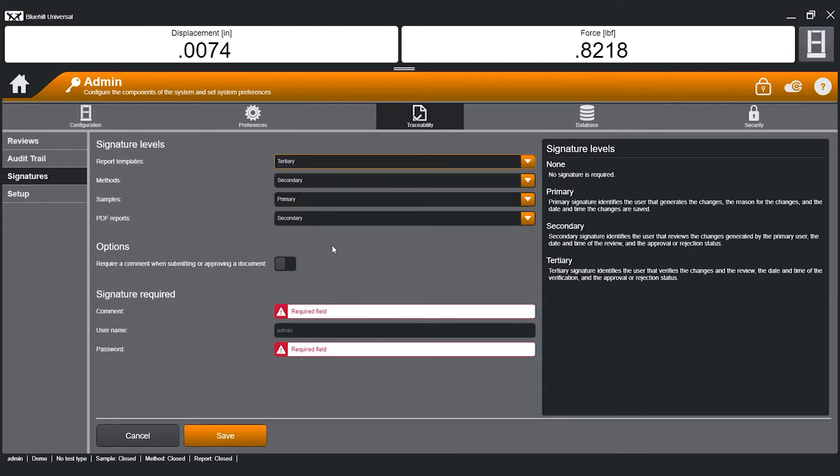Each Blue Hill file type can be set to require a different signature level to meet the requirements of your lab. If signatures are not required, this selection can be set to none.